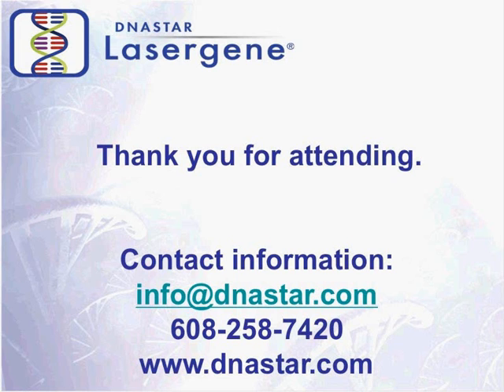Questions came in right from the beginning when Ian was speaking. So Ian, you can start, but Joshua, please chime in if there's anything you wish to add. Is there a good assembly program other than Staden that is in the public domain? Public domain, I don't know if there's a whole lot in the public domain, but I don't know what would be the difference necessarily between public domain and open source free stuff that you can get.